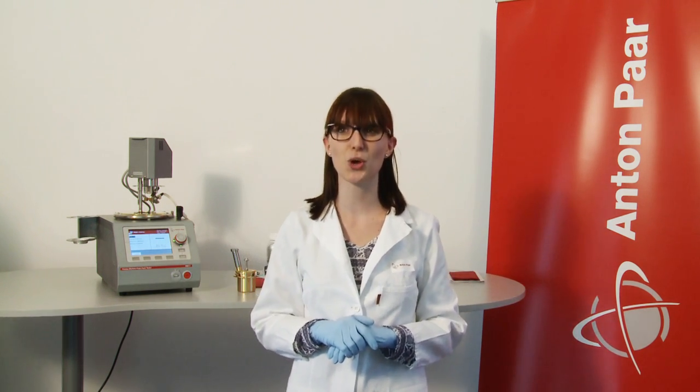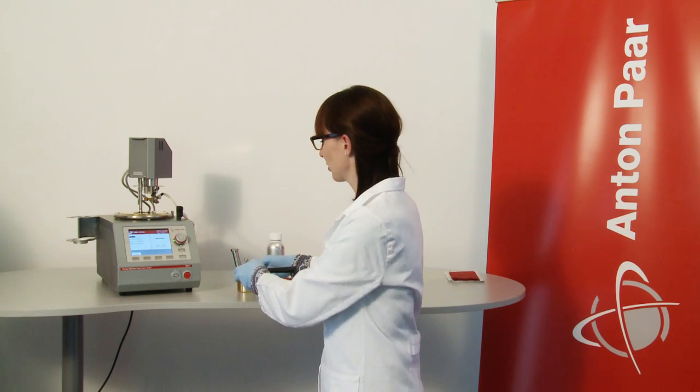Does that make a difference? Absolutely. The applicable ASTM standard calls for one opening only. PMA5 is the only flashpoint tester that is 100% compliant with that. All other comparable solutions deviate from the standard and feature at least one hole more. This may impact the flashpoint and falsify your test. Now, once the cup is filled and closed, place it in PMA5's heat compartment.